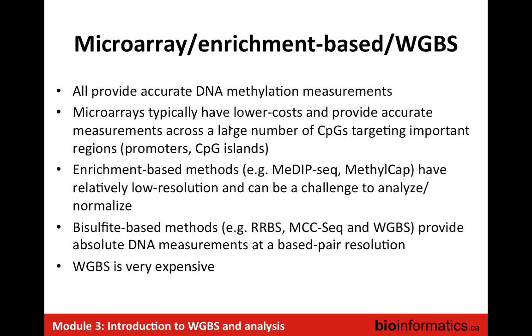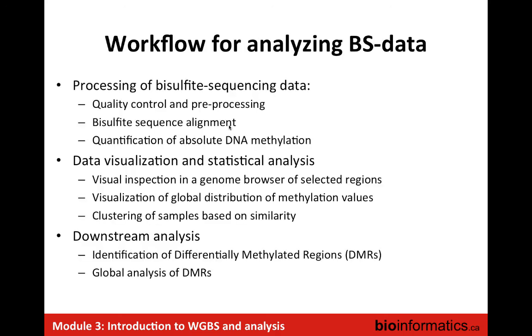All right. Now on to the actual data analysis workflow, mainly for the bisulfite sequencing data, whether it's enrichment-based bisulfite treated sequencing data or whole genome bisulfite sequence data. The main steps are a typical NGS workflow. There's the initial processing of the sequencing data, some quality control, then pre-processing, the bisulfite sequence alignment, where I mentioned there are a few interesting twists, and then the quantification of DNA methylation itself, then data visualization and some statistical analysis.